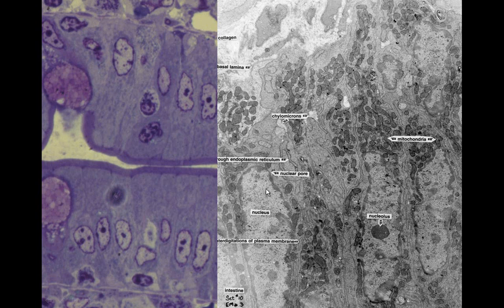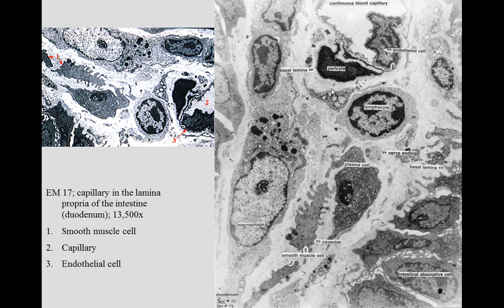This is the nucleus with the euchromatin, heterochromatin, as we see here. That one has a nucleolus, a euchromatin, heterochromatin. These two cells here are lymphocytes migrating through the epithelium, but you can see a host of mitochondria at the bottom associated with these cells. Again, we can see another one.